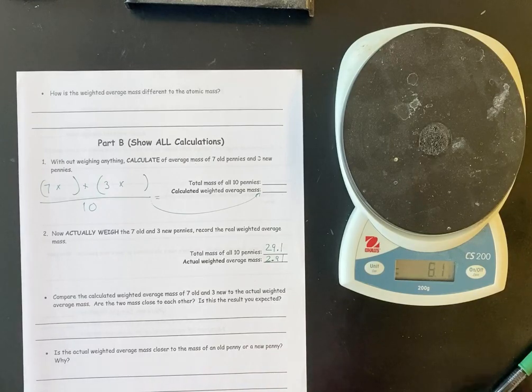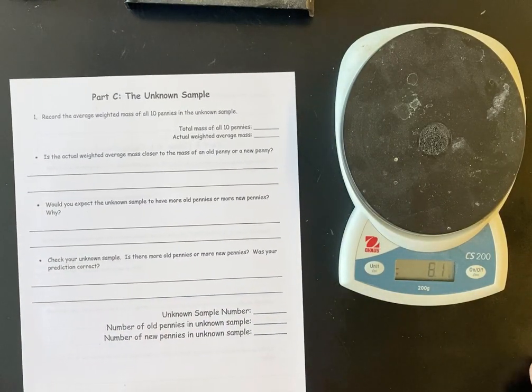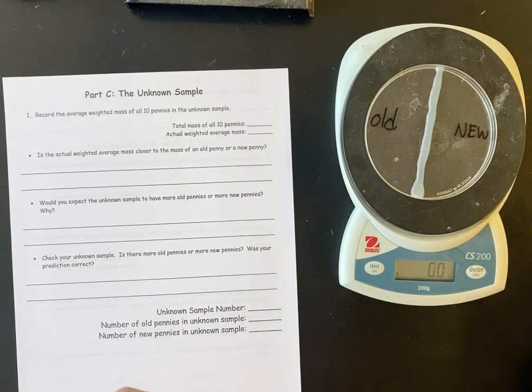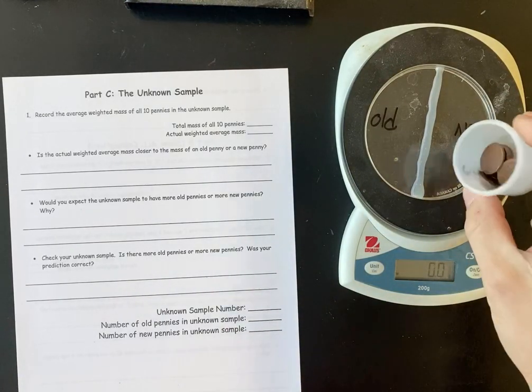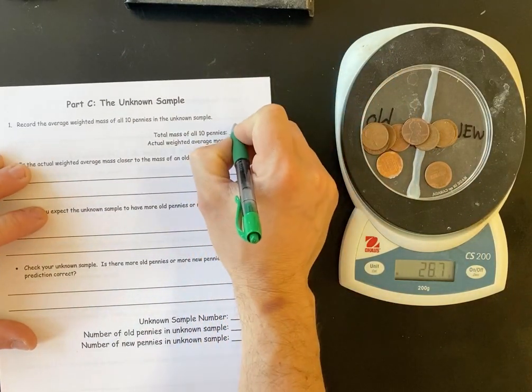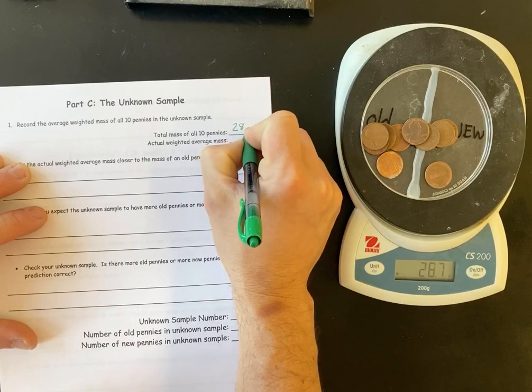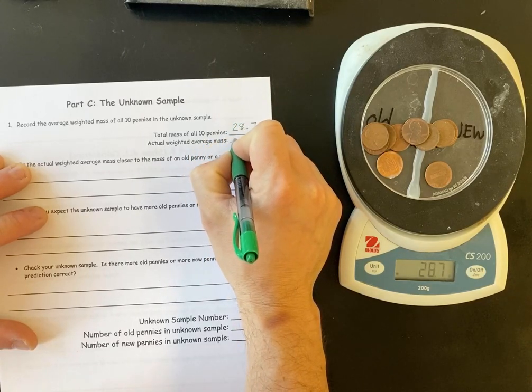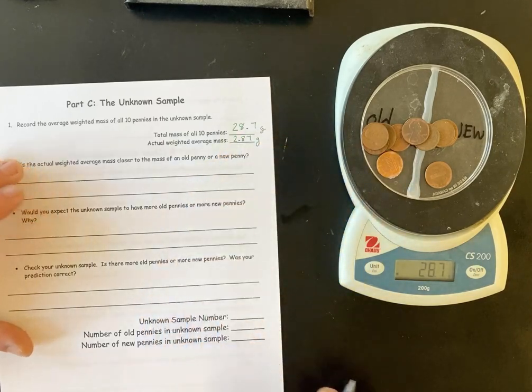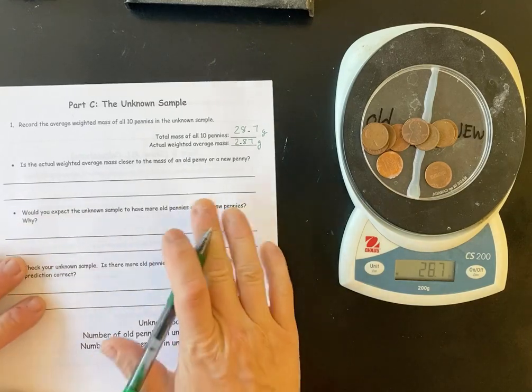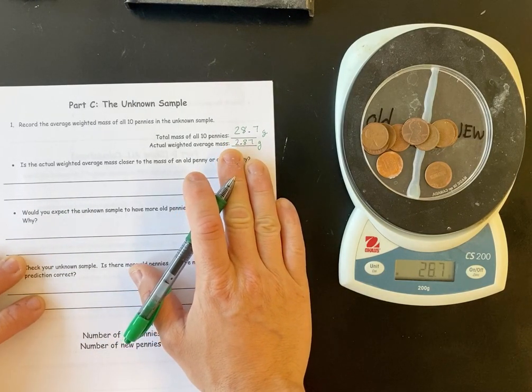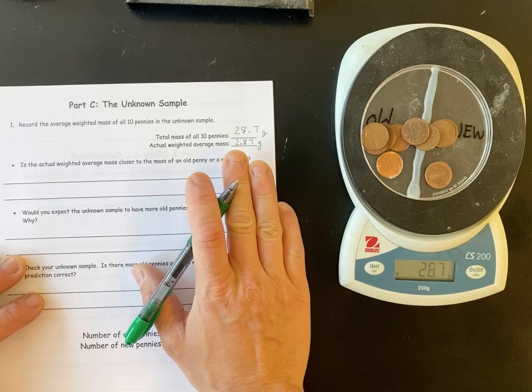And then we go to the very last part, which is the unknown sample. And so for the unknown, all we're going to do is weigh the 10 pennies because this is a mix. And so my average weight is 28.7 or my total weight is 28.7. My average is 2.87 grams when I divide by 10. And then the question is, based off the average, would you expect there to be more old or more new?